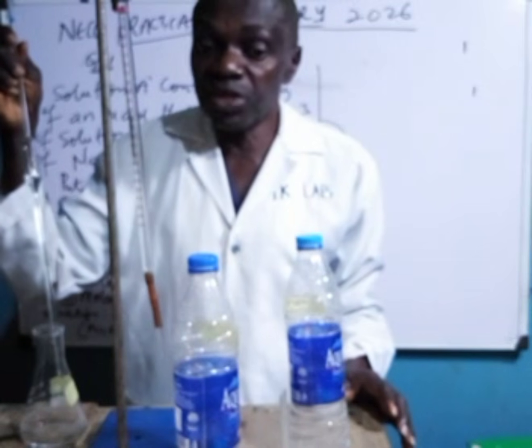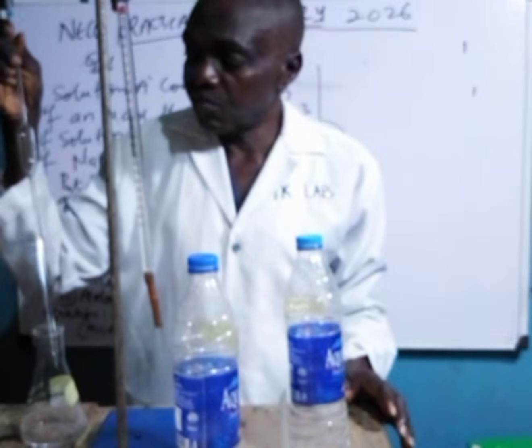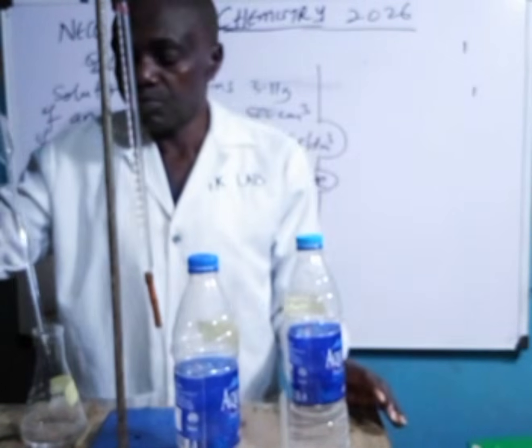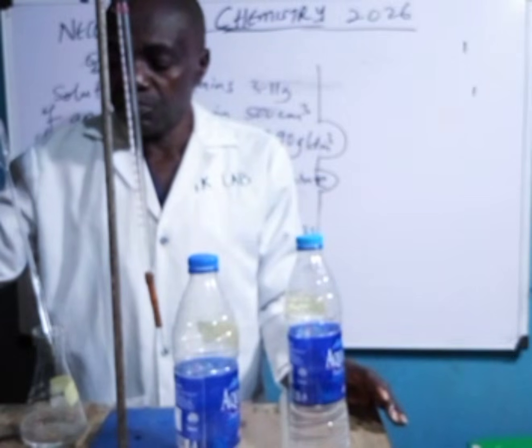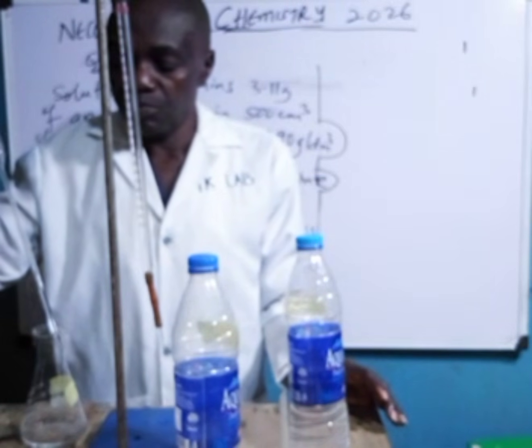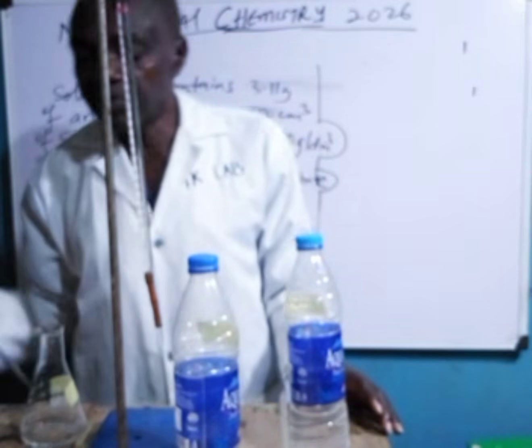If you blow it, it will increase the volume, so it will give you erroneous readings. That's it. So we have it.